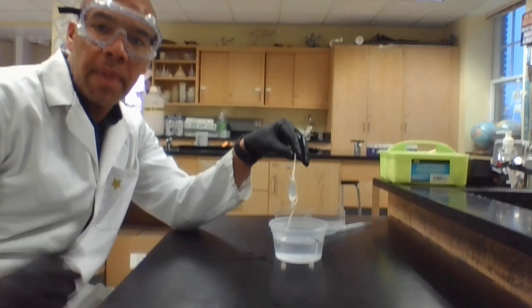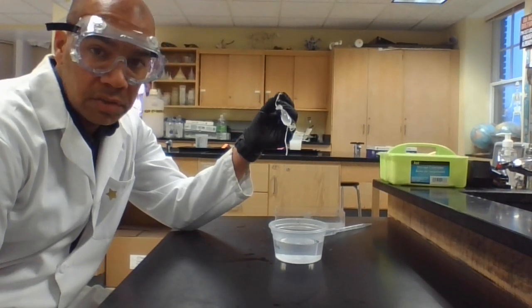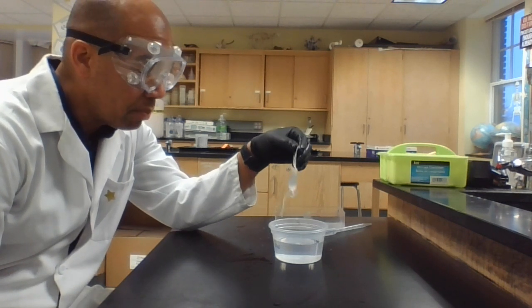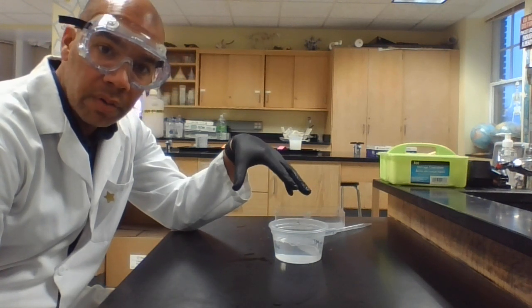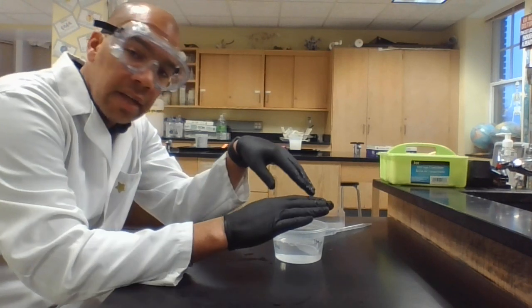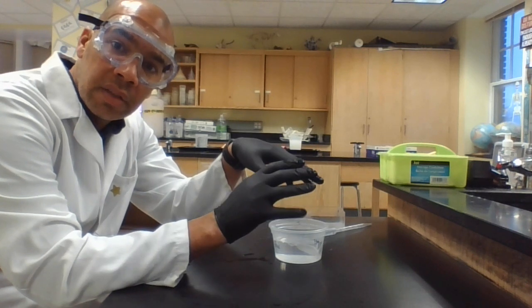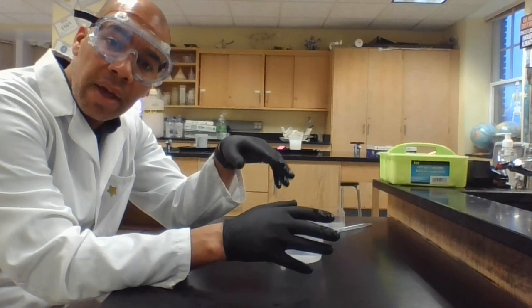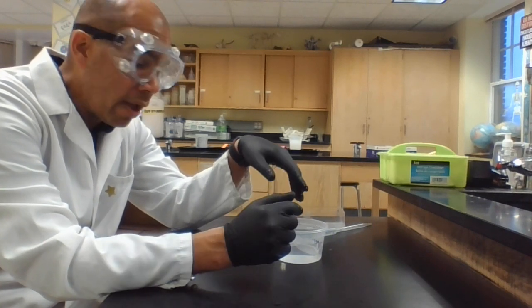All right, back at the table. And the next thing I'm going to do is I'm going to take this dialysis tubing with starch and glucose inside. I'm going to place it into our cup full of water. Now this cup full of water represents the bloodstream, which is coming up in contact with the small intestine. And normally this is where you get the transfer of nutrients from the small intestine to the bloodstream to be taken throughout the whole body for the cells in your body to use the nutrients, the nutrition, okay?